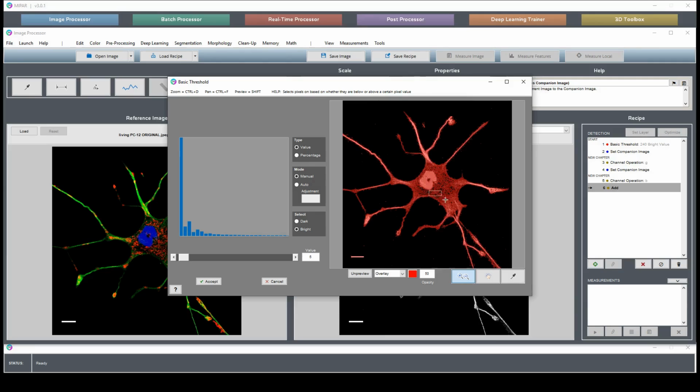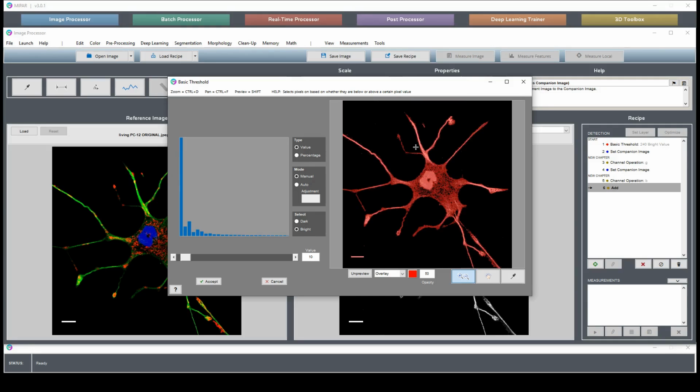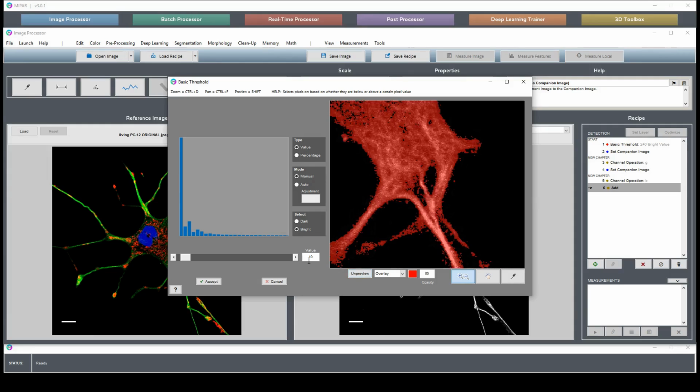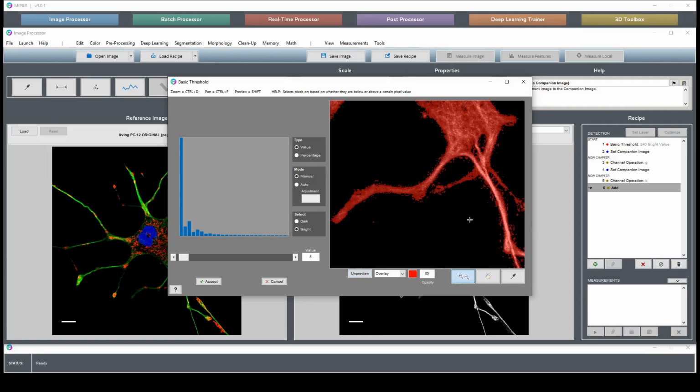Let's turn our segmentation strength down a little bit, 5, 10. When we get to 10, we start to lose some of these for the sake of this. So we go back down to 5. Okay, or even 3. No. Okay.